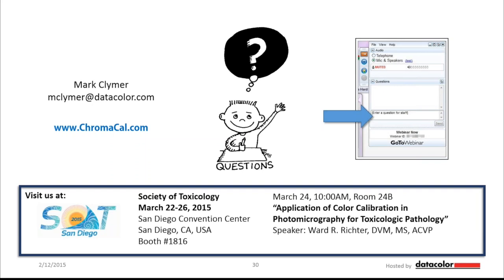Okay, yeah, good. Here's another question. Do you think linearity plays an important role in fluorescence imaging, even though those images are really only grayscale? I think even more so. I think it's important, and unfortunately, not sure if that same color calibration insight can be used for fluorescence. It's probably something Mark could answer, but we would really like to be able to use that in fluorescence as well to make sure our system is linear.